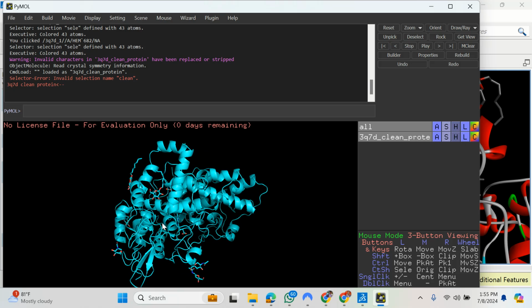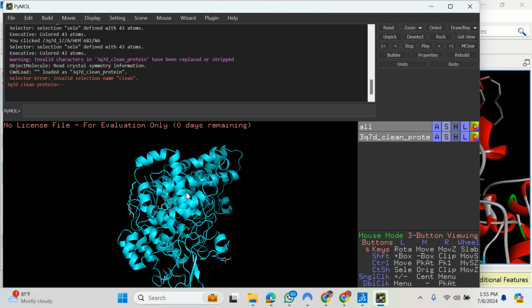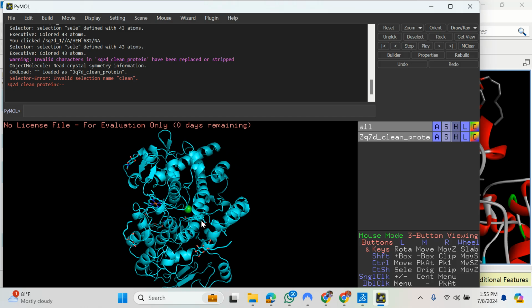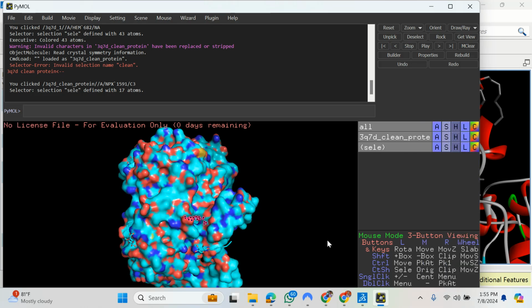I thought as much. Look at that ligand inside. The green ball is the cofactor. Yeah, the green ball is it. Look at the ligand here. That is this one. This one I just highlighted. Let's put it in surface view so that we can see that.